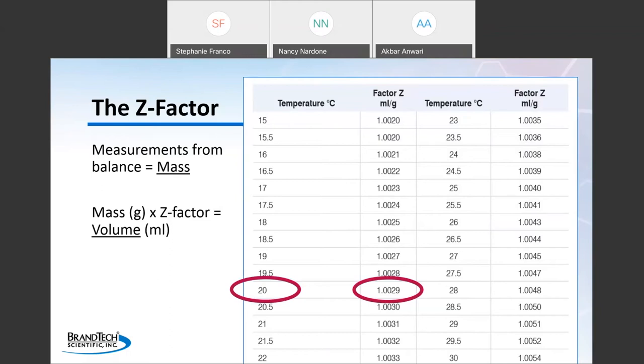Note that it doesn't really matter if each individual value is transformed using the Z factor or the Z factor is applied to the meaned values of the measurements. The end result will be the same.